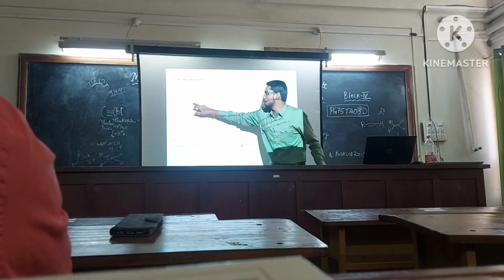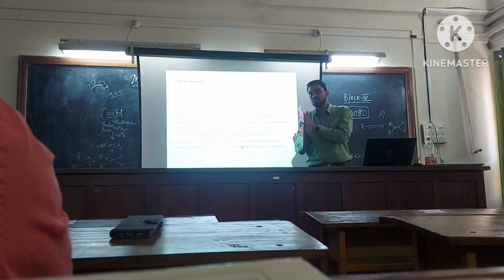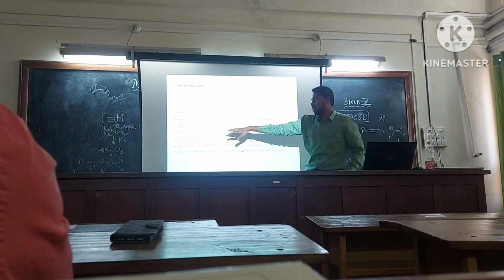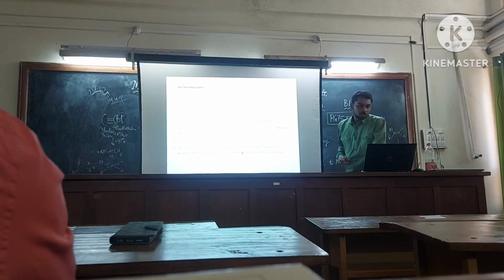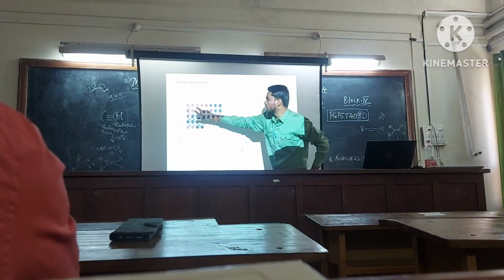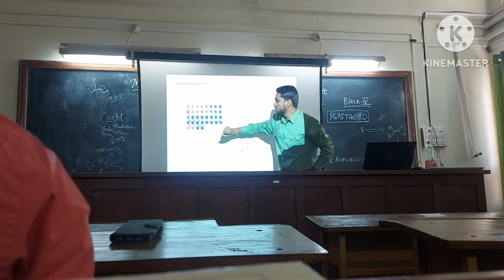So here we are using the minimum inhibitory concentration, MIC. This is the concentration that we need to give in order to inhibit the activity. We have used amoxicillin and ciprofloxacin as standard antibacterial agents. The copper oxide nanoparticles showed good antibacterial activity against gram positive and gram negative. So this is the overall picture. Here we have used Staphylococcus aureus and Escherichia coli as the bacteria. So we have taken PP here.